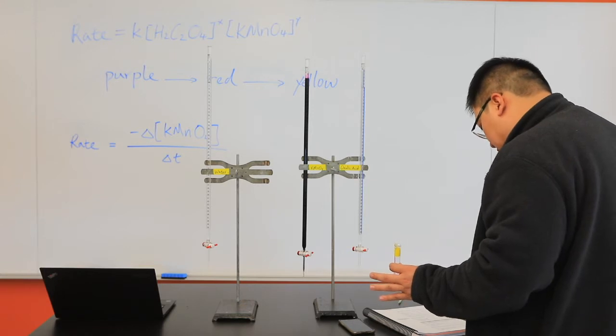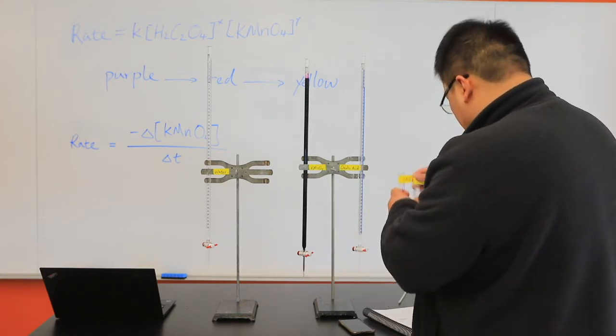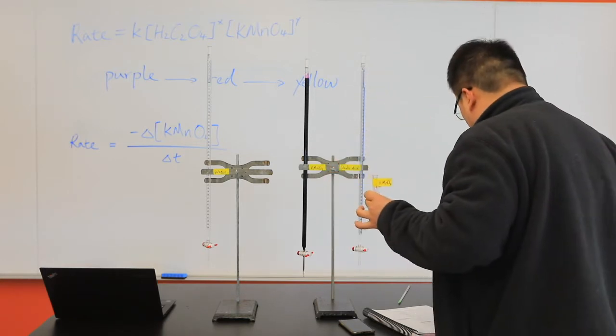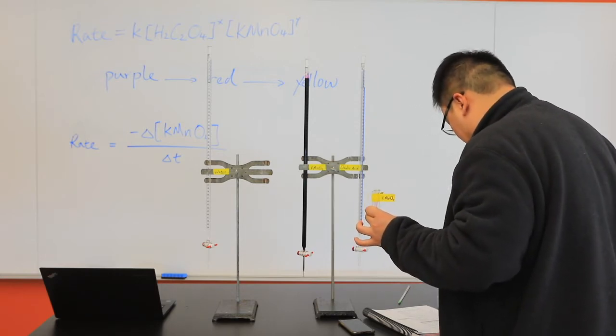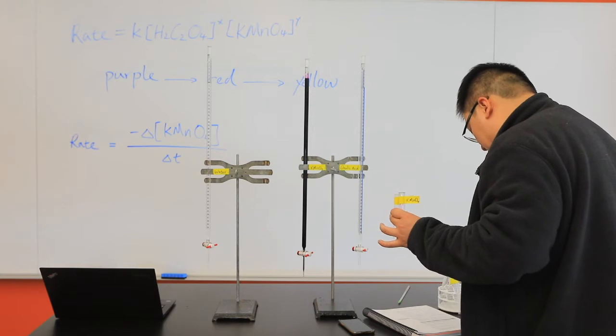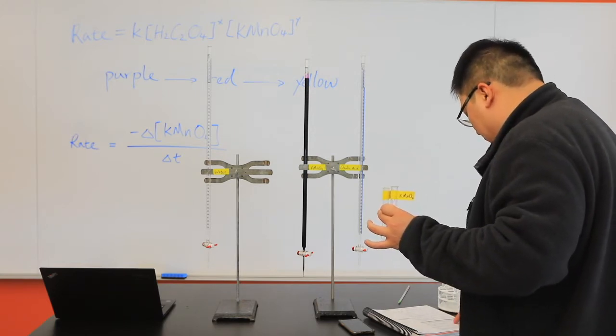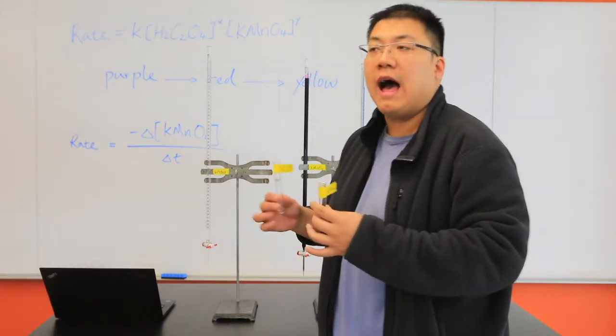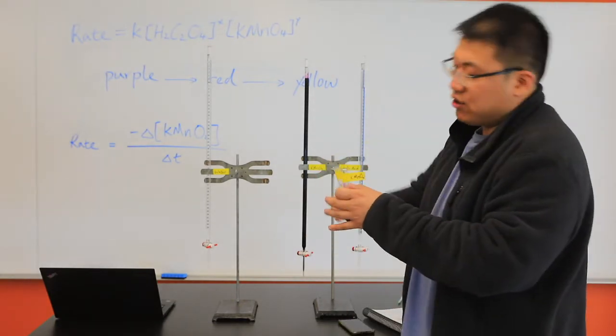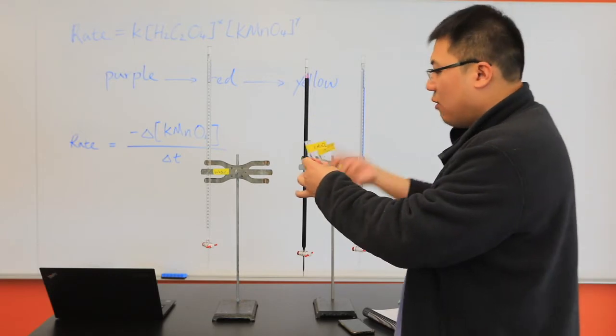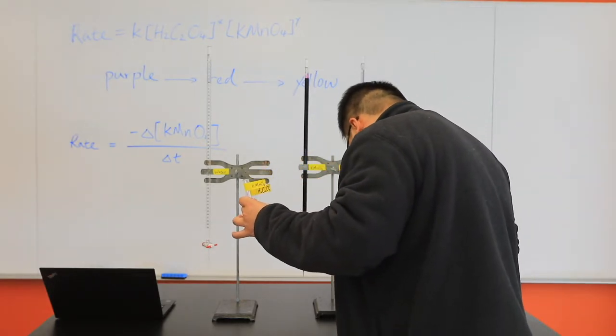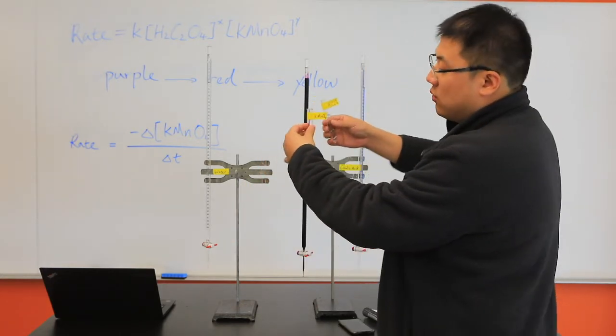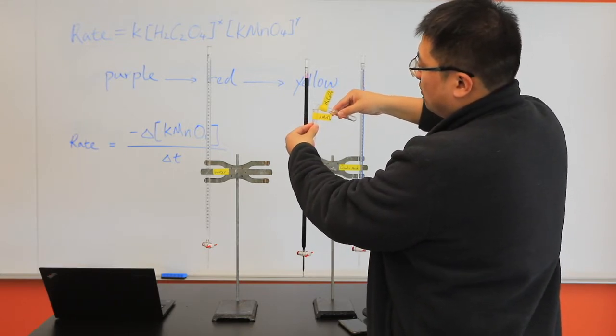So, following the instructions, I'm going to add the oxalic acid water mixture to the potassium permanganate test tube. I really should start timing when I am halfway at the addition of the oxalic acid solution to the potassium permanganate. Since I'm the only one recording it, I will start my timer after I poured in the entire test tube of the oxalic acid into potassium permanganate. So, I'll just count 1, 2, 3, and go. 1, 2, 3, go.